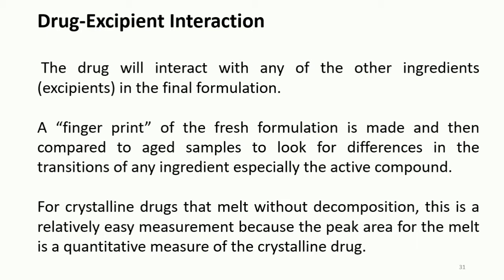We can get the desired data easily by just comparing the differential scanning calorimetric data of the fresh sample and the aged sample, and this would help us to judge the quality of a drug in a more specific way. For crystalline drugs that melt without decomposition, this is a relatively easy measurement because the peak area of the melt is a quantitative measure of the crystalline drug.